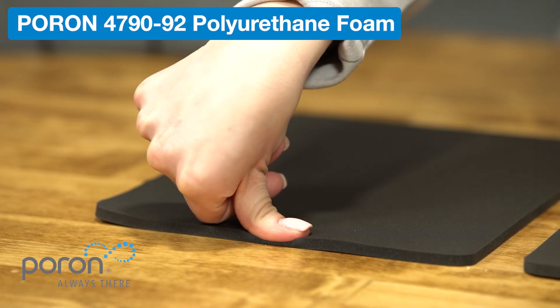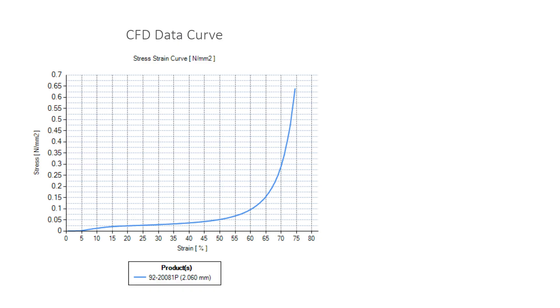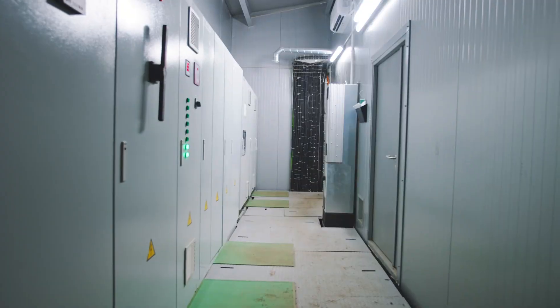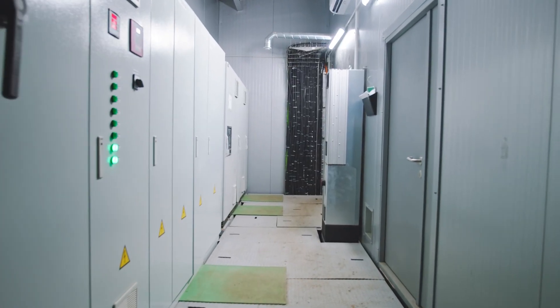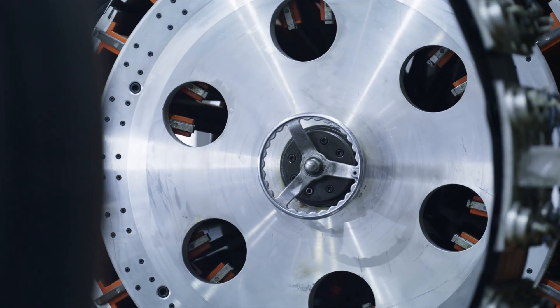Let's start with Poron 92 Extra Soft Foam. Wow, see how easily this compresses? Extra Soft Foam has a low CFD, meaning it takes less force to compress. It's perfect for cushioning applications, enclosures that require low force, or anywhere where the foam needs to conform to irregular surfaces.